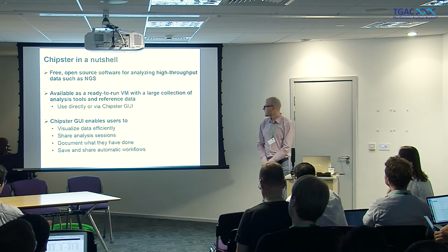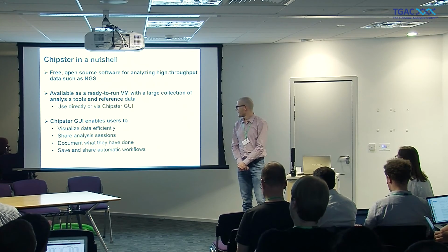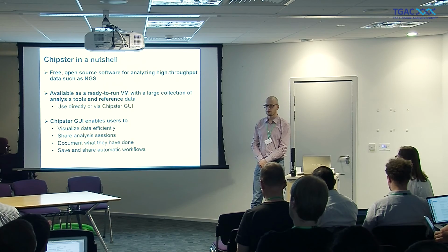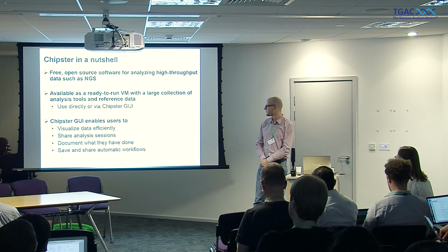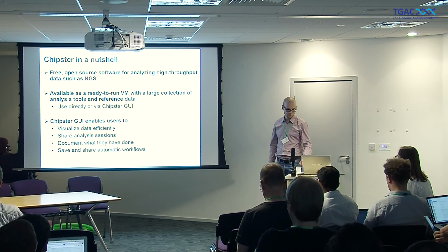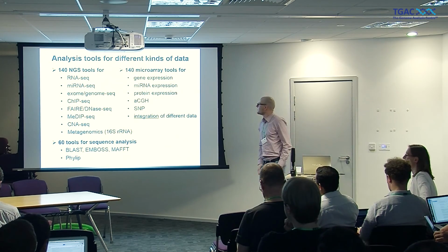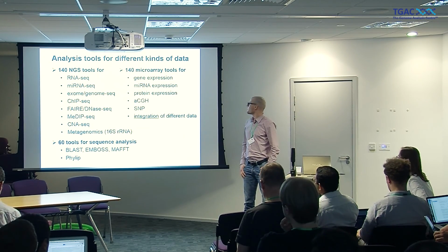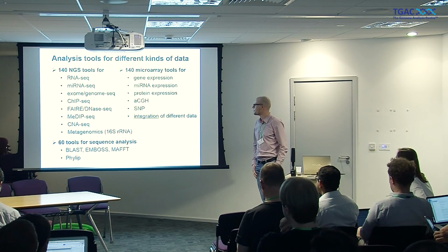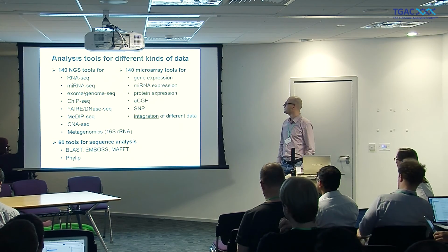So it's a combination of analysis tools, visualization tools, and then it takes care of the workflow, records the analysis history, and you can save and share workflows. It's about 10 years old project, so we have had time to include quite many tools there.